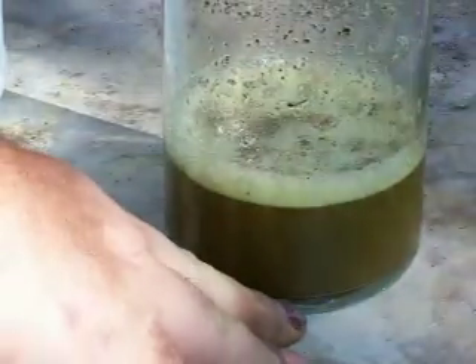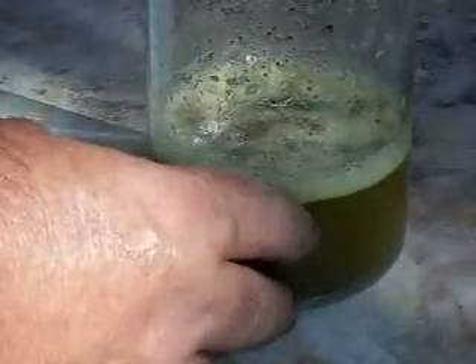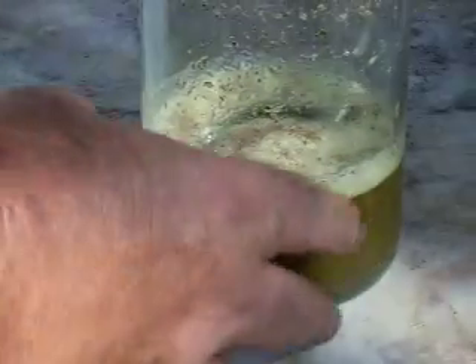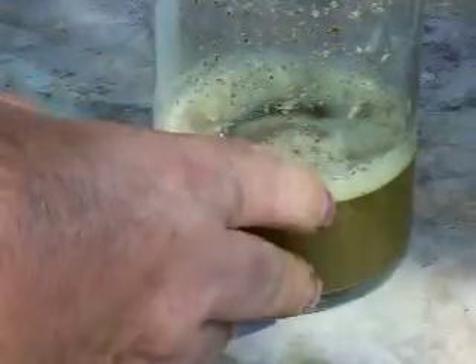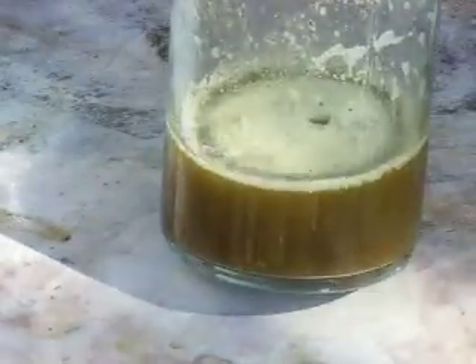I'll let it settle for what will settle. After the chlorine has evaporated out of solution I'll probably heat this up to drive the chlorine off, then dilute it with some water, and drop the gold with SMB. Do my rinses, the washes involved, and I'll get my clean gold powder back out of this.